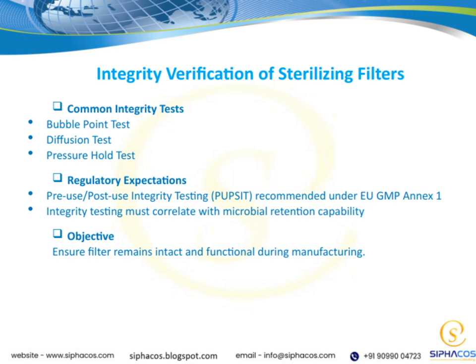This is vital because any compromise could lead to contamination and impact product safety. So, thorough and regular integrity testing isn't just a regulatory requirement. It's a key part of maintaining quality and safety in our processes.